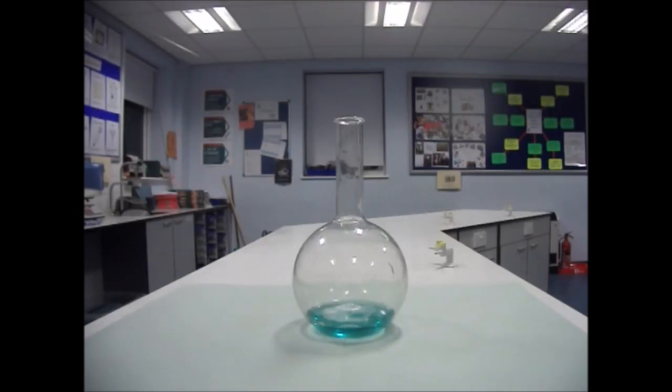Inside the round bottom flask I've got some 100 volume hydrogen peroxide and a small amount of household detergent, normal washing up liquid.